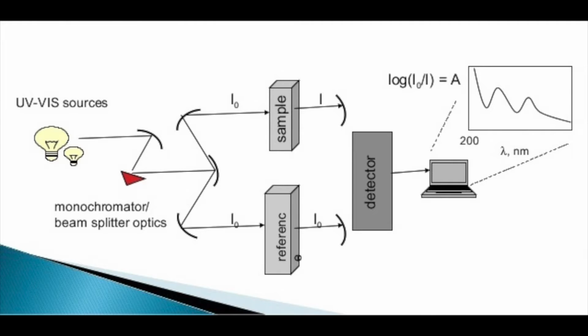Next, detector. Generally, two photocells serve the purpose of detector in UV spectroscopy. One of the photocells receives the beam from the sample cell and the second detector receives the beam from the reference. The intensity of the radiation from the reference cell is stronger than the beam of the sample cell. This results in the generation of pulsating or alternating currents in the photocells.